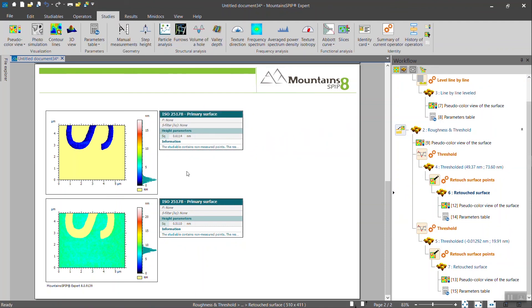And then you can compare roughness values in the bottom layer and in the top layers.